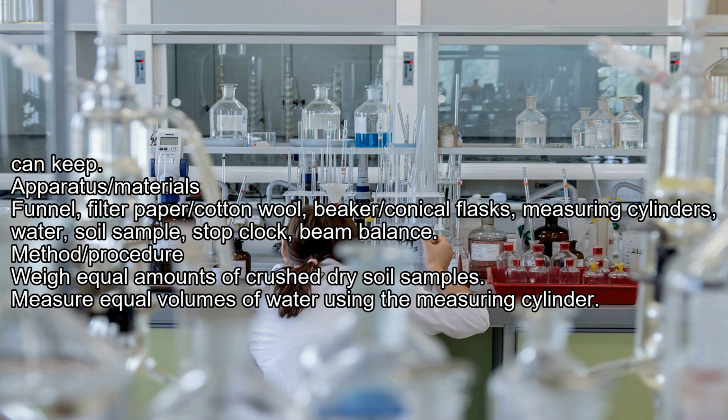Apparatus/materials: funnel, filter paper/cotton wool, beakers/conical flasks, measuring cylinders, water, soil sample, stop clock, beam balance. Method/procedure: weigh equal amounts of crushed dry soil samples. Measure equal volumes of water using the measuring cylinder.